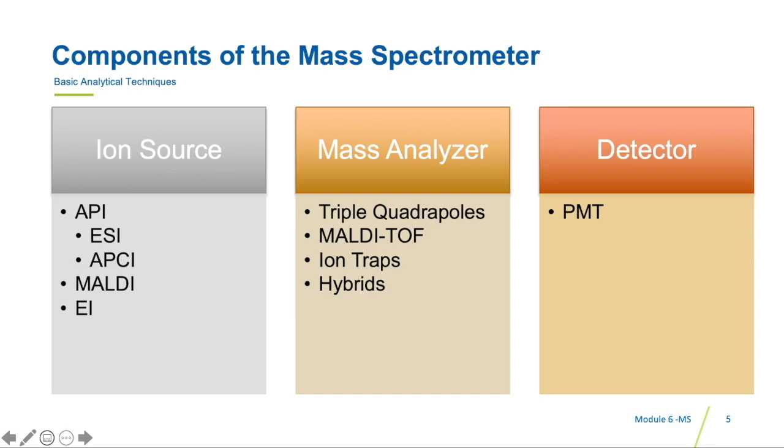We will discuss different implementations of this system that provide certain advantages for the detection and quantitation of different types of chemicals in different concentrations. Finally, a simple detector that counts particles without any type of selectivity is present at the end of the process to count whatever reaches it. While the technology to achieve this process is very advanced and was only made possible by developments in electronics, fluid mechanics, and software components, the principles behind it are quite straightforward.